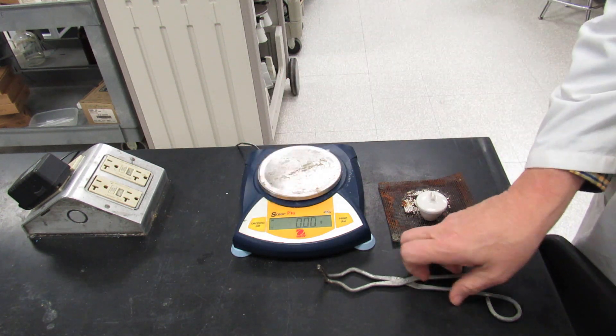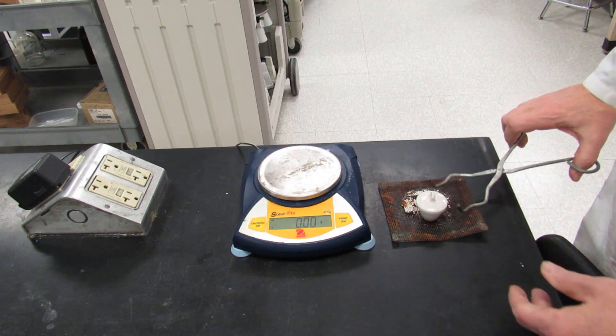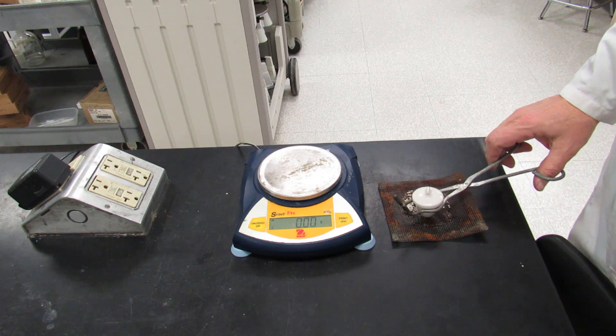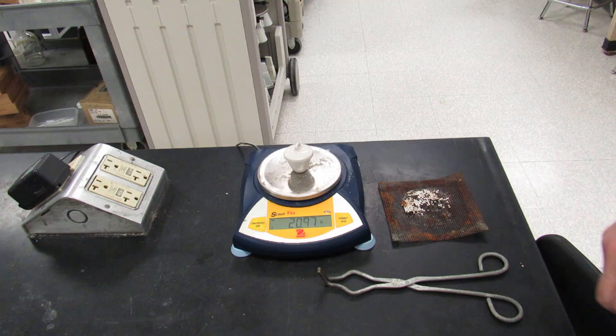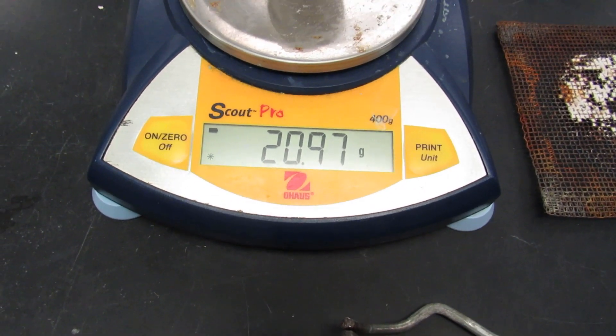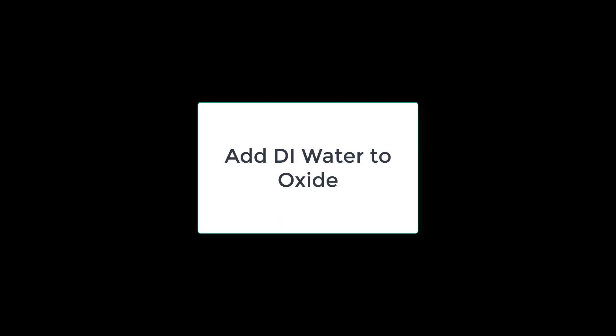Now, you're going to have to mass the magnesium oxide with the crucible and cover. The mass of the crucible cover and magnesium oxide is 20.97 grams.